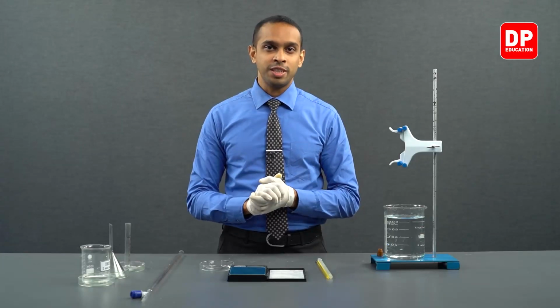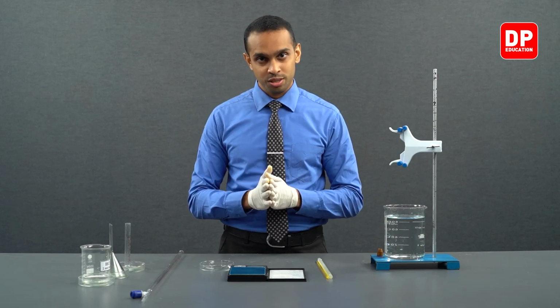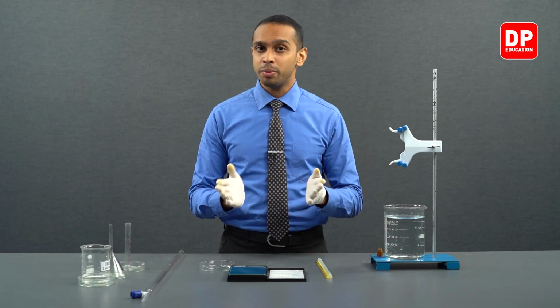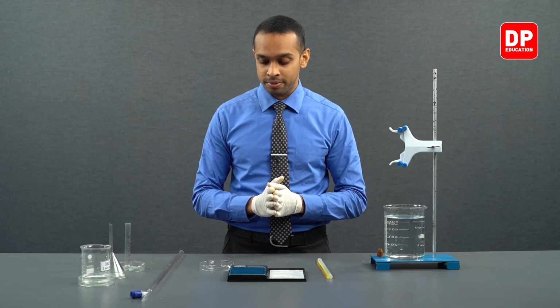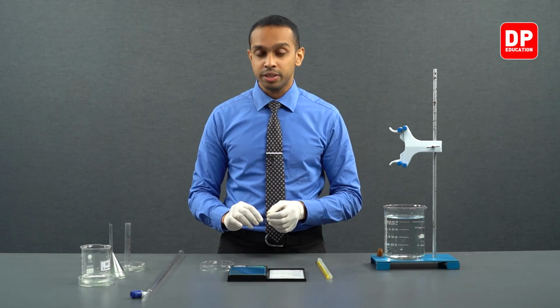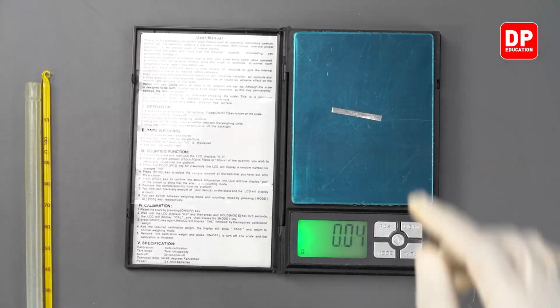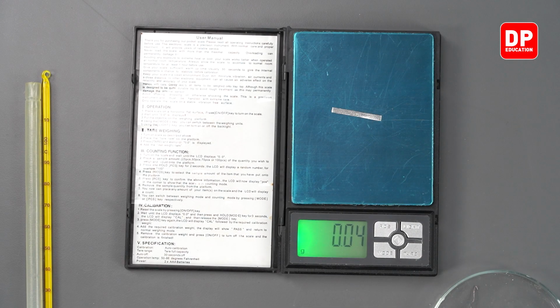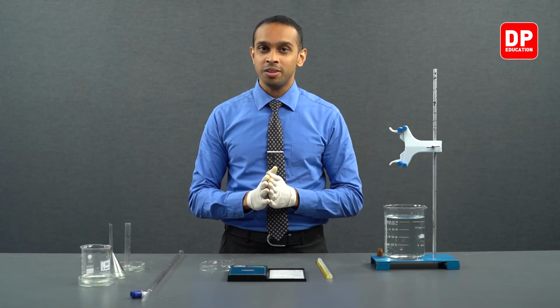In the second trial of this experiment, we will be going through the same steps that we followed in our first trial. However, we will have to measure the mass of the magnesium strip again to see if it is around 0.05. We will take our magnesium strip, we will turn on our digital balance, and we will place our magnesium strip to see if the mass is close to 0.05. Over here, we can see the mass is in fact 0.04. That is okay. We can go ahead with this mass and continue on with our experiment.